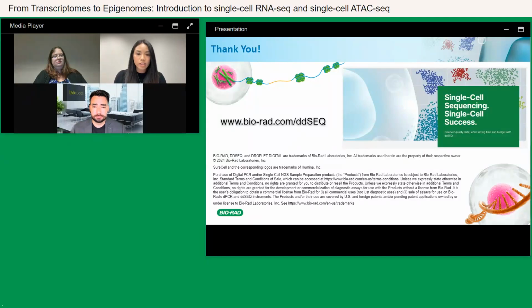But I'll focus my answer on the single-cell ATAC-seq because the tagmentation process in this technology is where a TN5 enzyme cuts up chromatin DNA in fragments to allow for the addition of the TN5 adapters. And this process is random, and it gives information of nucleosome positioning, which is a key factor in gene regulation.